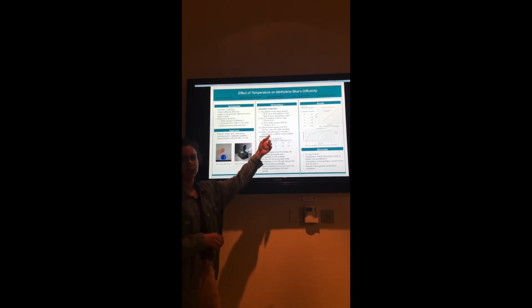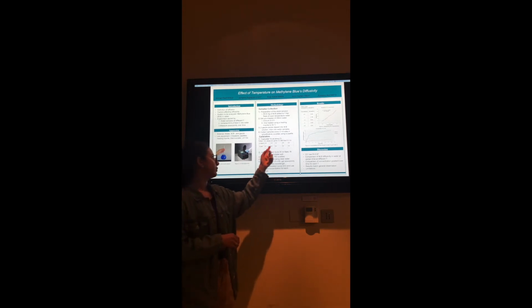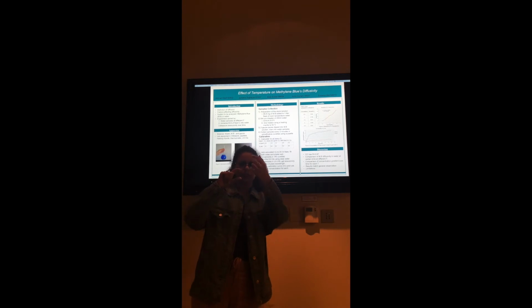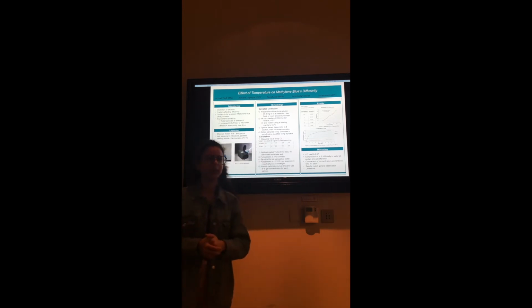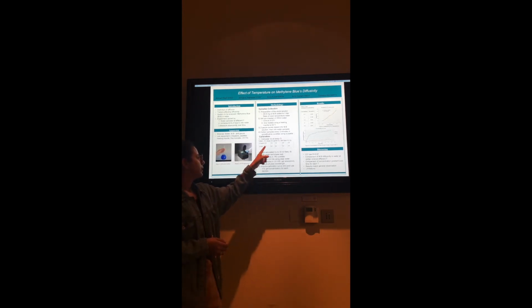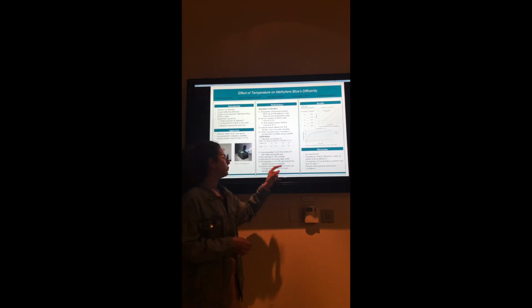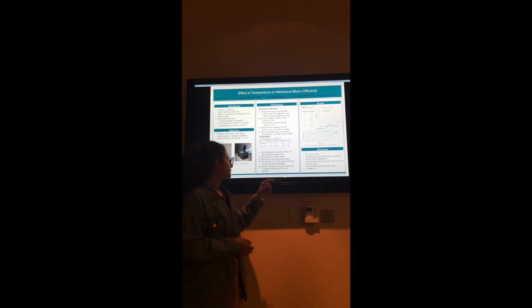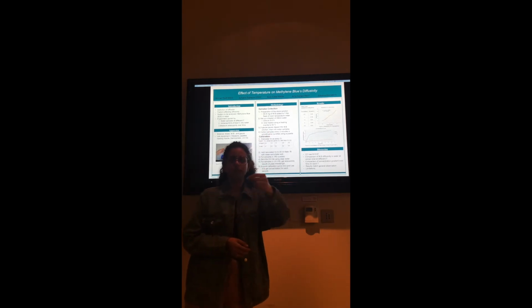We had our samples collected and now we have our 5 cuvettes of the fixed concentrations. And now we'll use the UV vis. First of all, we have to zero the UV vis with a cuvette filled with water, transparent, so that we can have the UV vis zeroed. And then we begin by our samples. We begin by our known concentrations and we will get their absorbability. And then for our sample collection, we will measure each cuvette and get its absorbability.